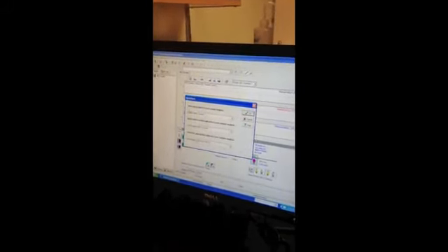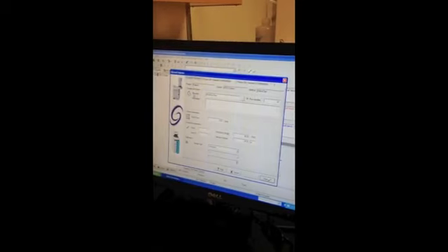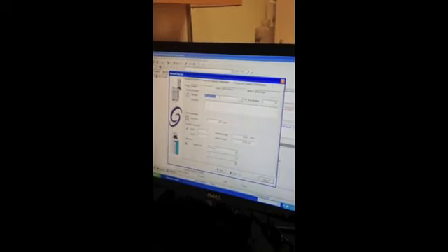Sending the method over. Go to Acquisition, the Dropbox, click Quick Start. Choose your method name, click OK. Change the file prefix to whatever the sample is that you're running. Click Start.